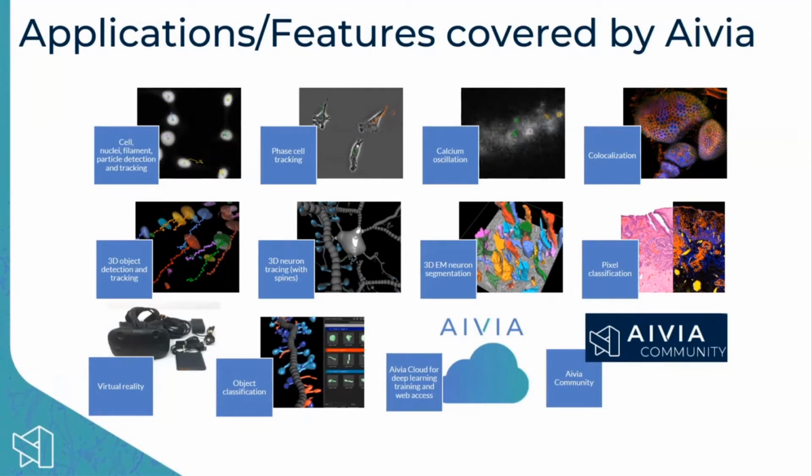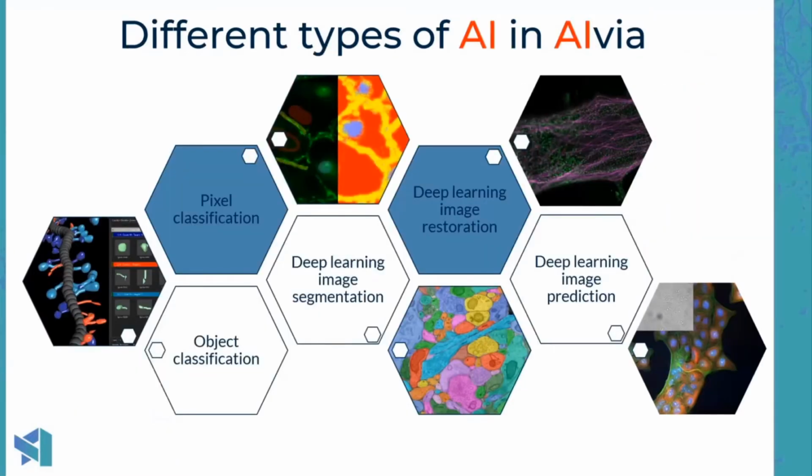It does the viewing job. You can create animations as well. And it does also some segmentation jobs using the pixel classifier that you can preview and save the annotations to collaboratively create more ground truth. And then you can train a model in a real full Aivia in order to apply it there.